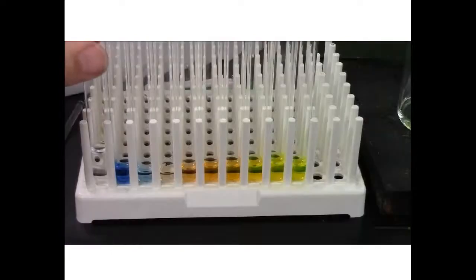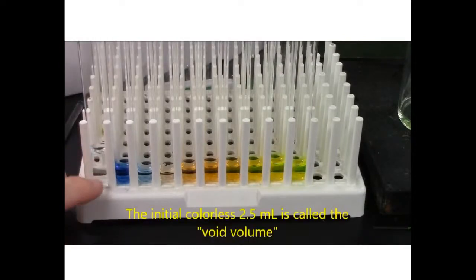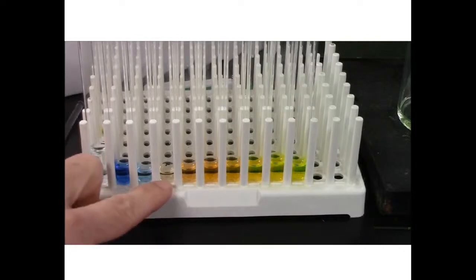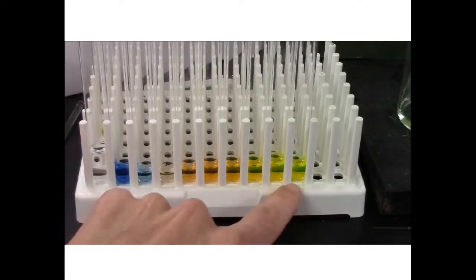Here's the fractionation. This first tube has nothing in it. So this volume, which looks to me about 2.5 milliliters, is called the void volume, where nothing comes out. But then the blue molecules, the blue dextran, came through the column swiftly. So this is about a milliliter. Some of the blue dextran tailed into the next fraction. This is low concentration. Then I have a nearly colorless fraction here, and then the fluorescein starts coming out here.